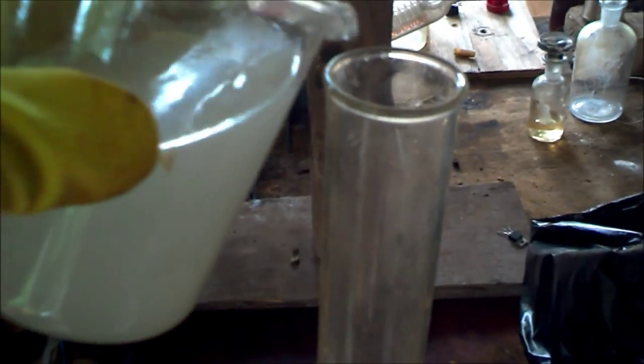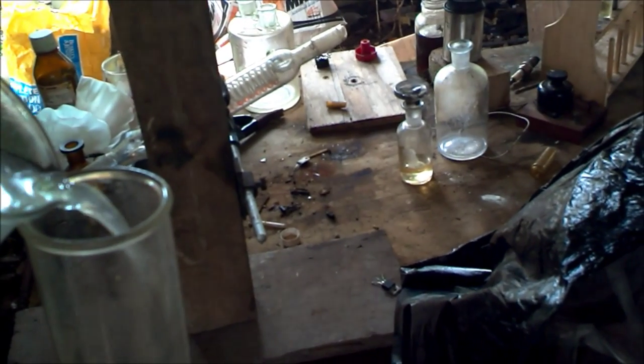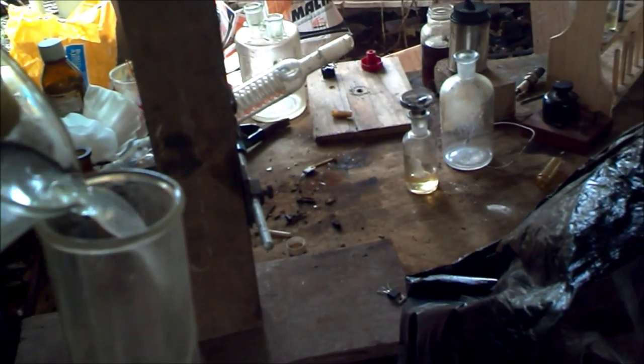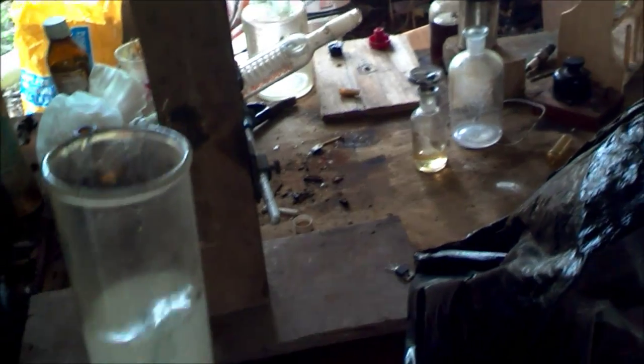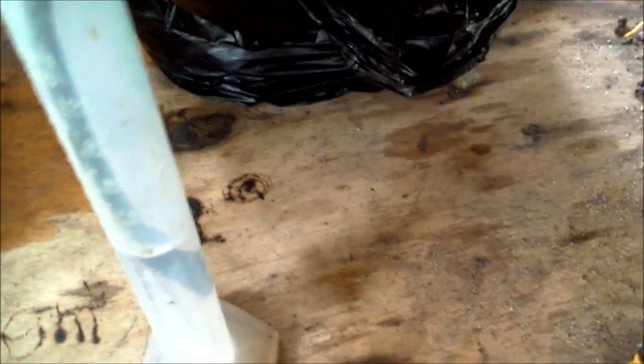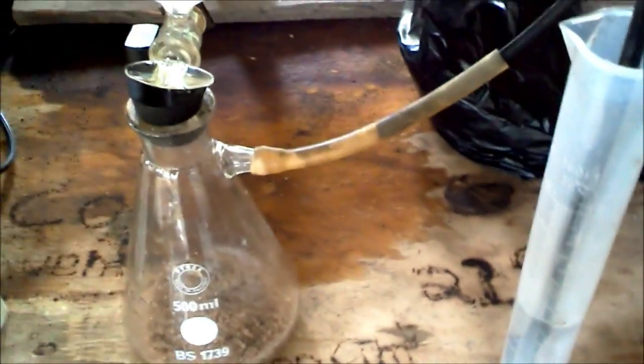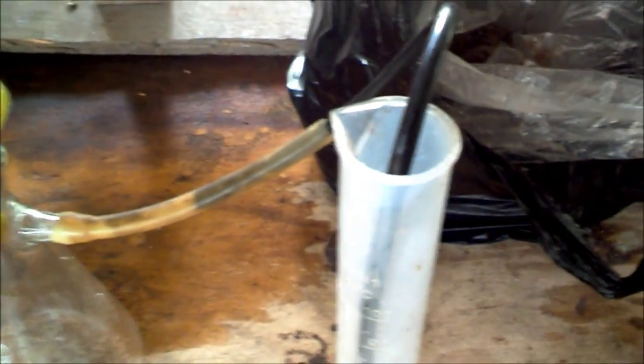Now get the sodium hydroxide solution and carefully pour it into the separatory funnel. Take the tube and put it into the water. This should be distilled water. Now put it on the top.